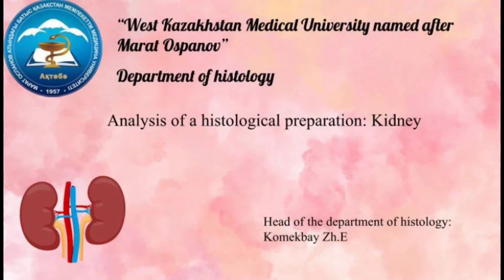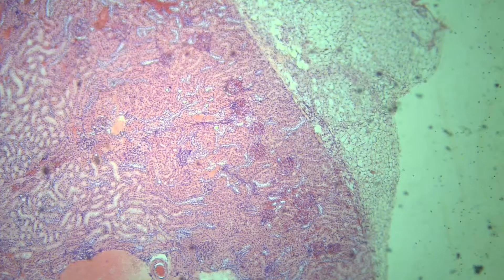Hello students! In this video, we are going to study histology of the kidney. This slide is stained by hematoxylin and eosin.